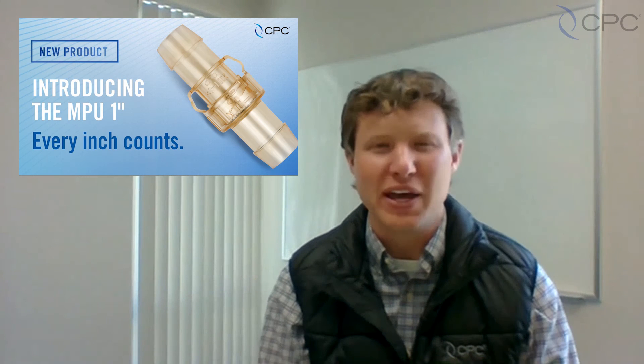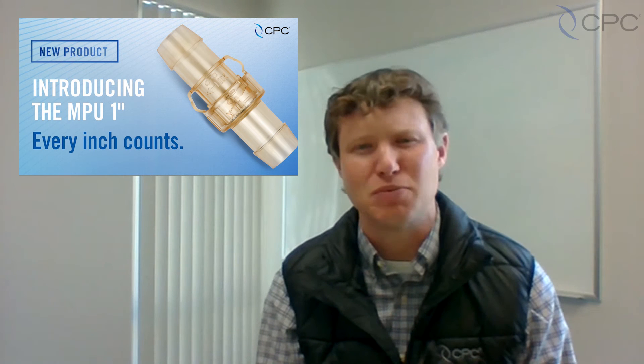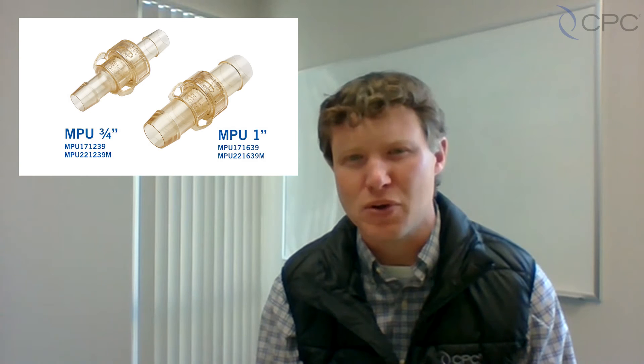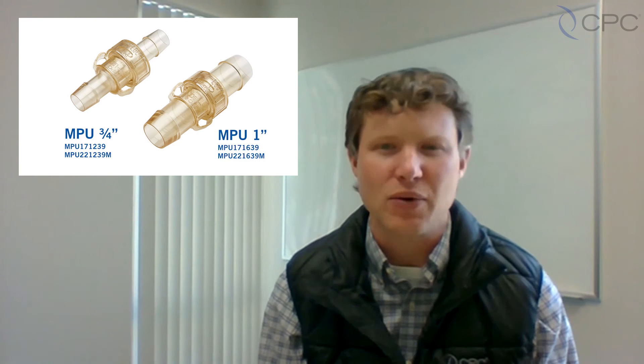Hi, I'm Nick Johnson, part of the product management team at CPC, and we're happy to announce the release of the 1-inch MPU series, now available worldwide throughout CPC's market-neutral supply chain. The 1-inch hose barb MPU joins the 3-quarter-inch hose barb MPU that's been used in the industry for 20-plus years, with a proven track record of reliability and performance.